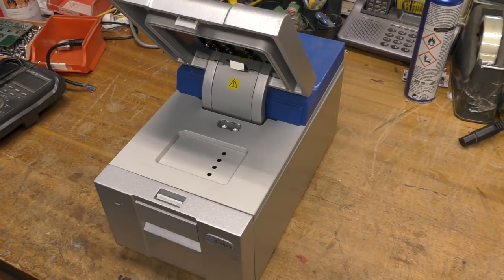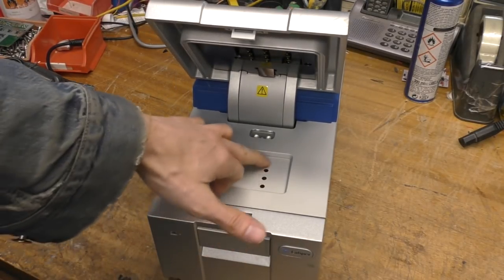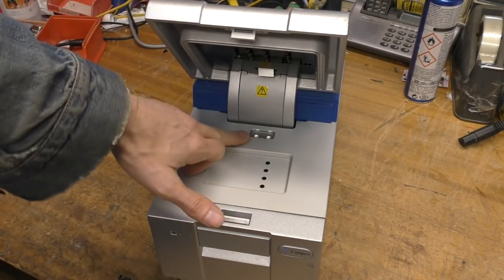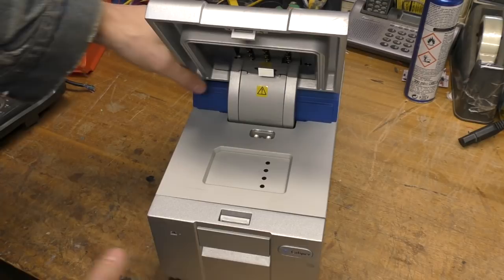Some chemicals come in it, and then others you add, like the dyes and so on, I think you add later, and then you use a pipette to take out the samples afterwards. So you can't really see a great deal from the top. There are the optical windows for the optical analysis. There's a barcode reader, so there's a barcode to uniquely identify each chip, and there may be some calibration and batch information on that barcode as well.